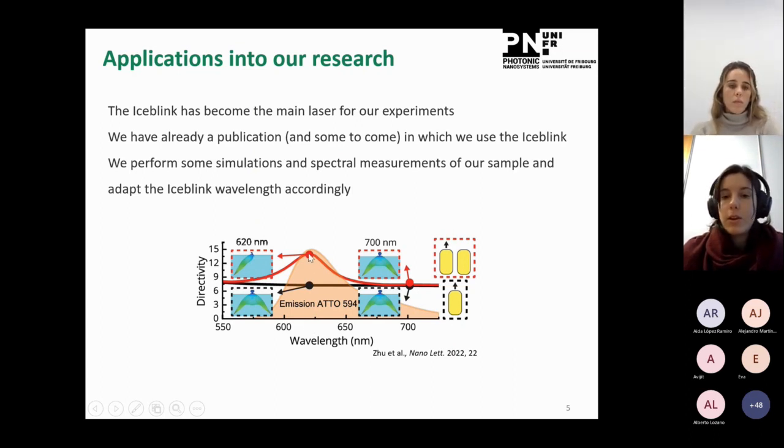So this is a constraint, and we have to adjust to this. Since we know the maximum wavelength we expect, we chose a dye that would be overlapping with this. Then we need to select our excitation wavelengths to excite this fluorophore as optimally as possible. For this, we use the supercontinuum and, just with a cleanup filter, select the right wavelengths for optimal excitation. And indeed, we showed that this was working.